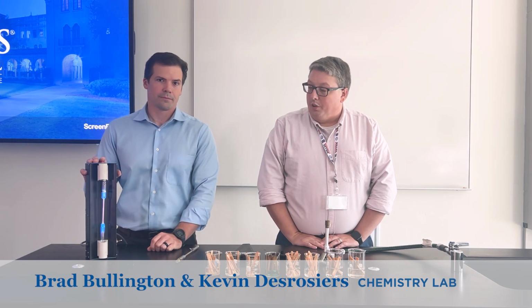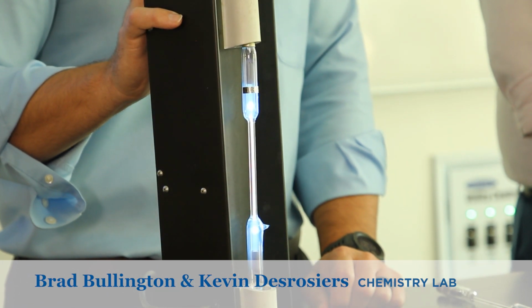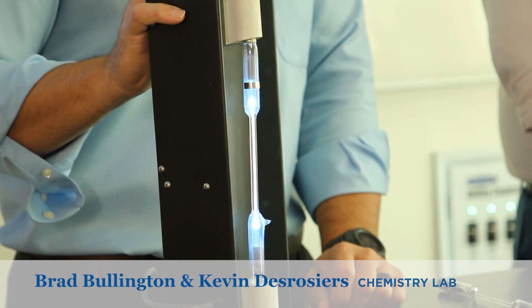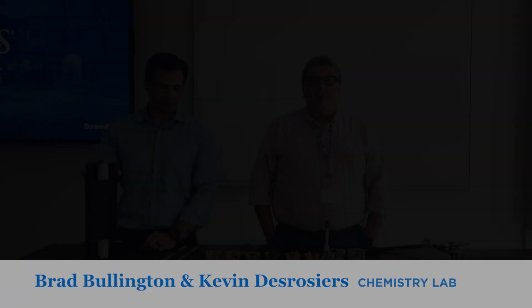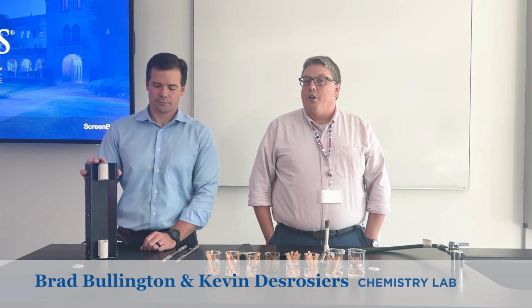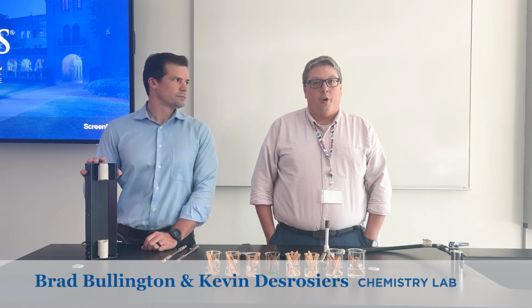So mercury, unlike hydrogen, gives off a blue color when it is excited. The students, when they go through and view this with their spectroscope, will see several more lines that are now given off, denoting that mercury's electrons are going into several different places as compared to hydrogen. These two different experiments, the flame test and the bright line spectrum, are different ways of analyzing what possible elements we could be working with.